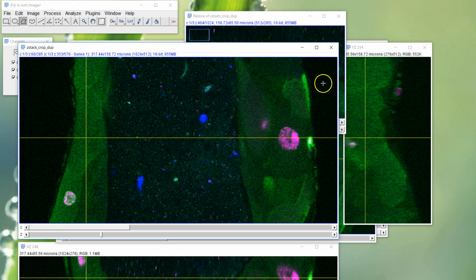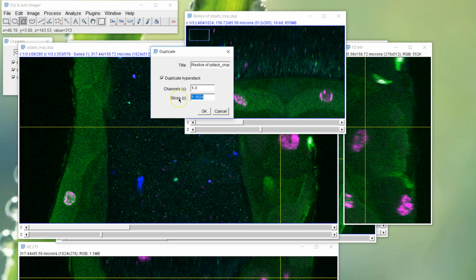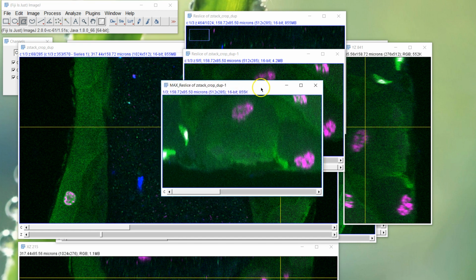So then you can just pick the Z's you need to bring out. And what I've done is I've moved my position. But if you get the numbers from here, 841, for example, would be the slice I am in this direction. You could then duplicate from this one. Pick 841, so 839 to 843, and have that there, and then do the Z project, and then that will give you the extended view in that direction.